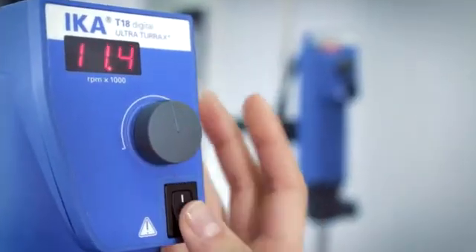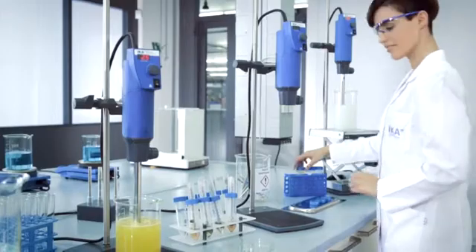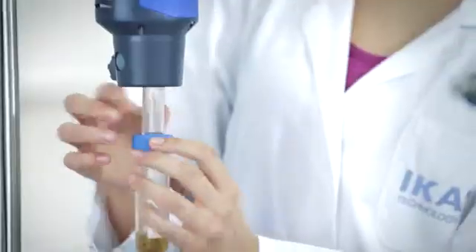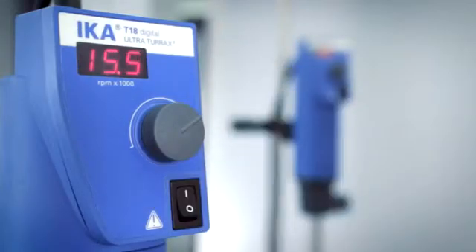Disposable dispersing system. Easy change out. No cleaning required. No risk of cross-contamination. Maximizing your efficiency and productivity. One of the seven wonders of the modern laboratory world.